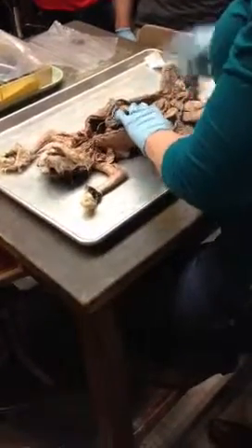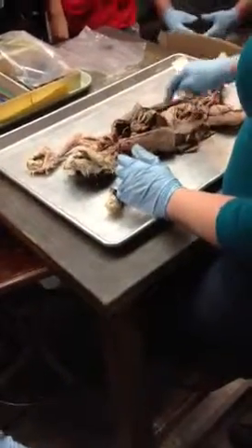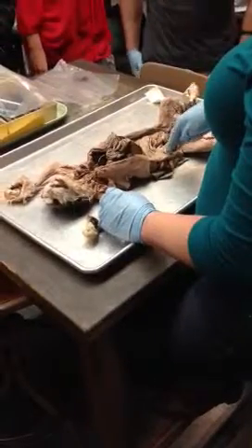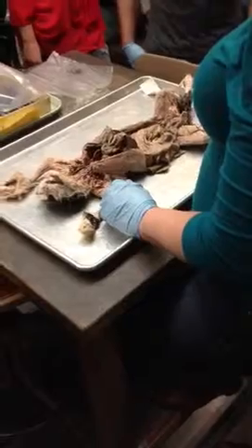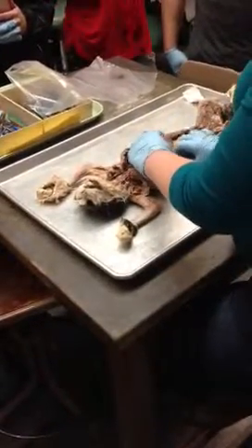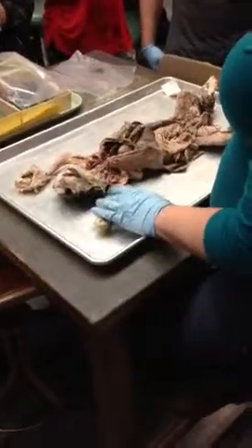And for the regions of the large intestine, I would sort of tuck the small intestine behind so you can clearly see the curvature of it. And, okay, corners would be your flexures. Pin here would be descending, ascending, transverse, sigmoid colon. Okay? And then we have the gallbladder in here. Okay? So that's the digestive system in a nutshell.